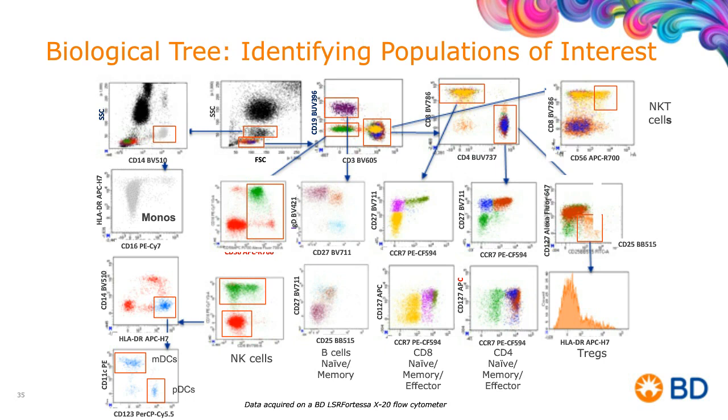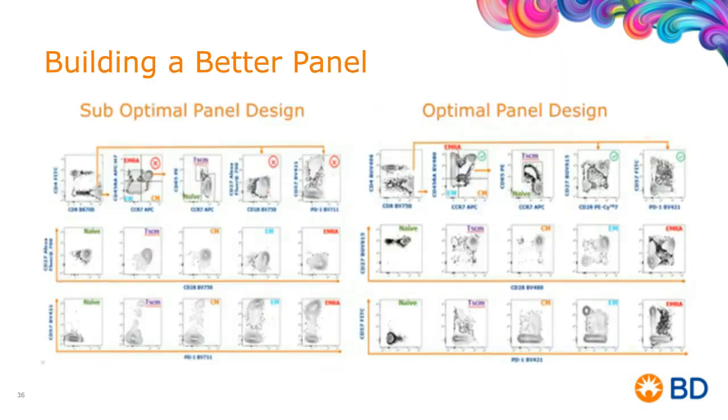So we go back to how we build a better panel, and we remember that slide at the very beginning where it shows the suboptimal panel, and it says, well, we could take those fundamentals that we just talked about and we can change a couple things and make a significant impact to the resolution of multiple different places in this panel. So let's take a look at a couple of them, not at great depth, but to show you the ease of using those fundamentals in making change and how it impacts and builds a better panel.